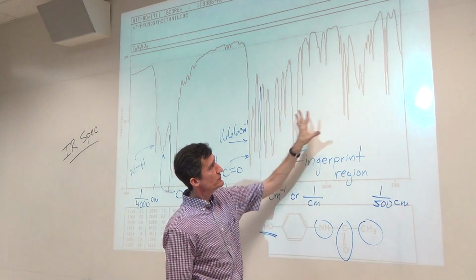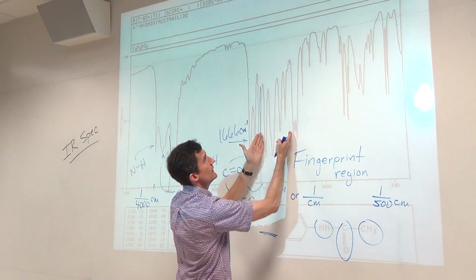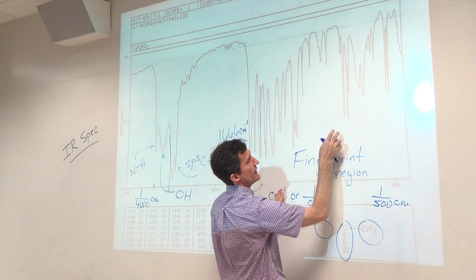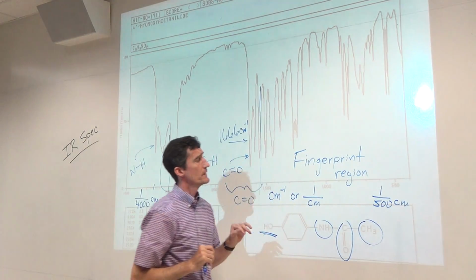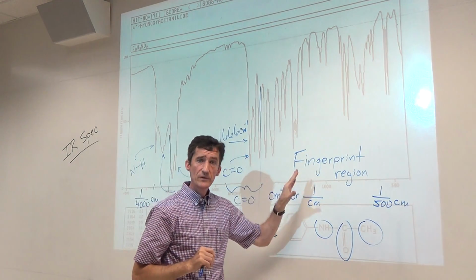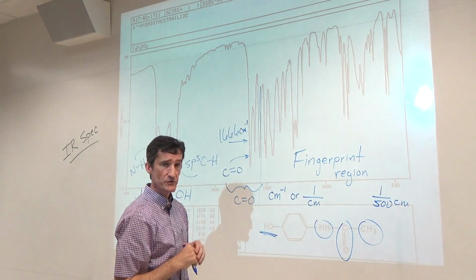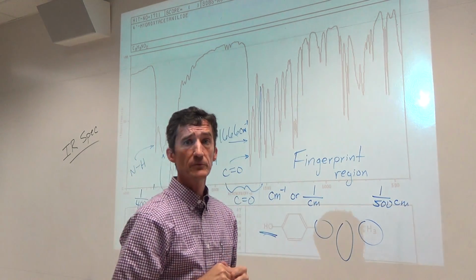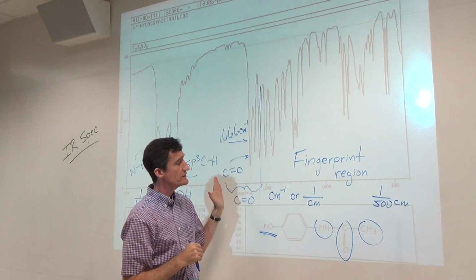Acetaminophen will give this type of distribution of peaks. For example, several here, then weaker ones here, and then a couple of strong ones here, a couple of strong ones here, a couple of strong ones here. Acetaminophen will always give that type of band structure. Today, 5,000 years from now. Okay? That becomes essentially like a physical constant.